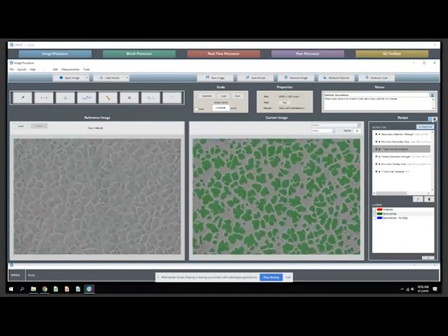And that size threshold is something that, of course, can be exposed to your users if you want them to play with that. We actually looked at the histogram of all particle sizes in order to decide on what that threshold should be. As you know, if you're with image analysis, there's a lot of iteration that goes on with building these algorithms.